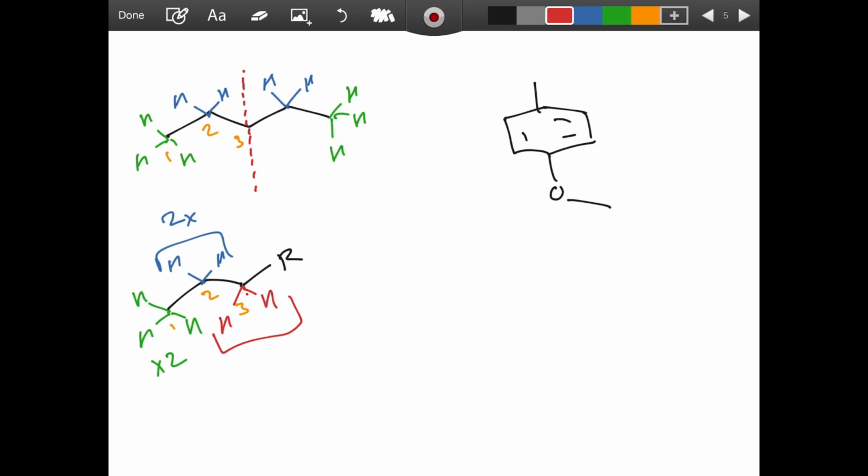So carbon 3, you might be saying, well, it's a CH2 here, and there's a CH2 on carbon 2. But the 2 hydrogens on carbon 3, right, what are they beside? What is their environment? Well, these right here, the ones on carbon 3, they're beside a CH2, and then they're beside, effectively, in the NMR's mind, nothing, right? This R effectively is nothing as far as the NMR is concerned.